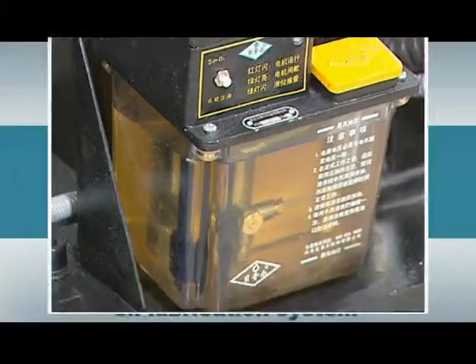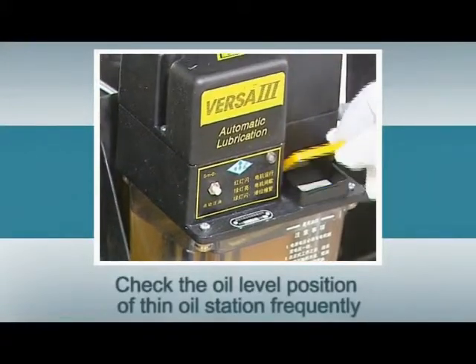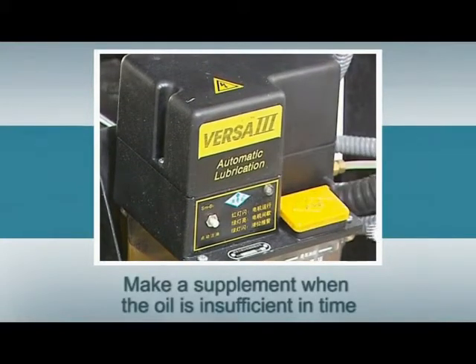Maintenance of a thin oil lubrication system. Check the oil level position of the thin oil station frequently. Make a supplement when the oil is insufficient in time.